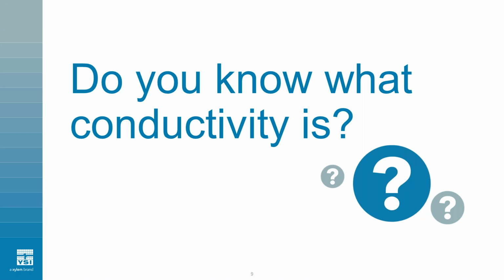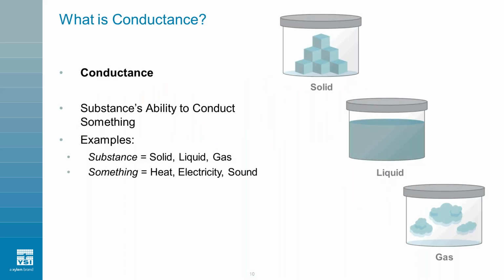I want to first talk about, well, do you know what conductivity actually is? When I say conductivity, are you aware of what conductivity actually is? So I'm going to talk first about what is conductivity, and to start, it comes from conductance.